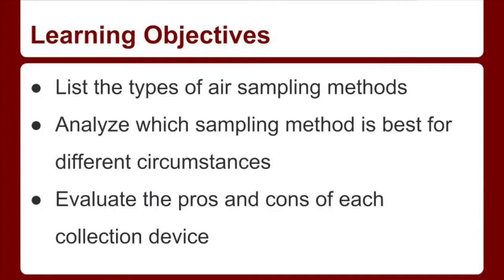Learning objectives. You should be able to list the types of air sampling methods, analyze which sampling method is best for different circumstances, and evaluate the pros and cons of each collection device.